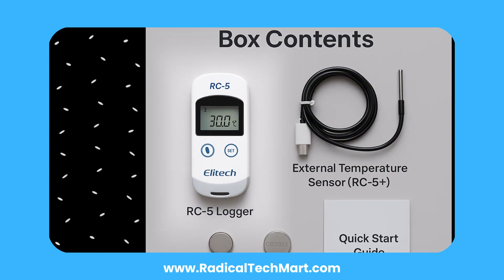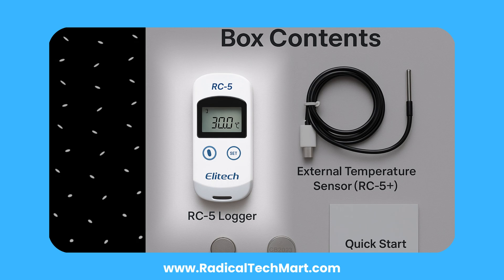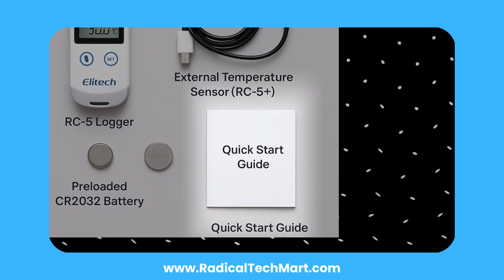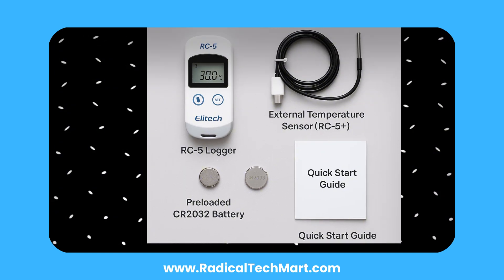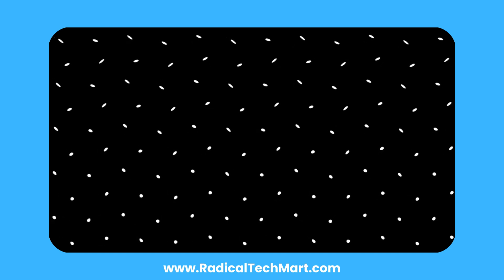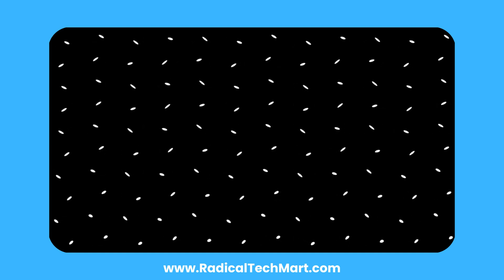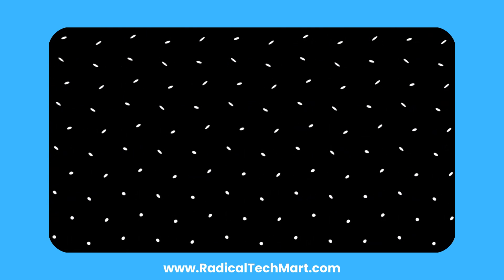Inside the box, you get the RC5 or RC5 Plus temperature data logger, a quick start guide, and a pre-installed CR2032 battery. The RC5 is perfect for general use, while the RC5 Plus includes an external temperature sensor and audio alarm, ideal for more precise or enclosed monitoring applications.